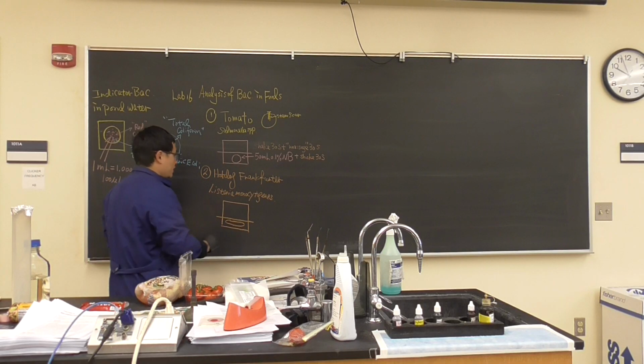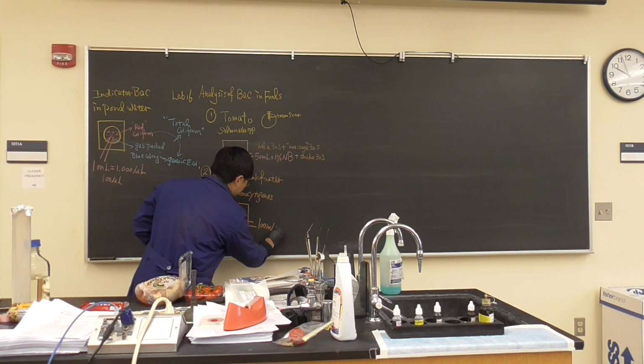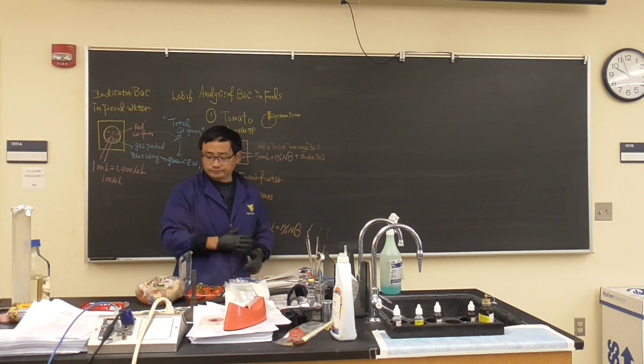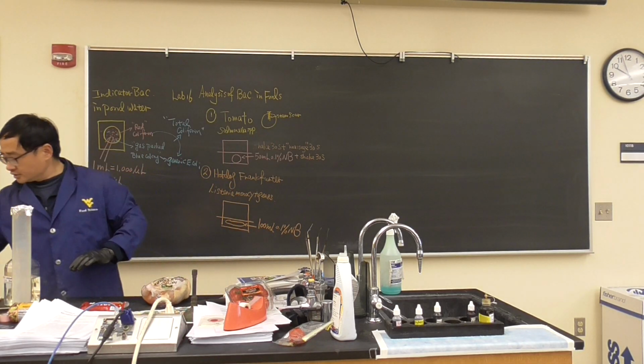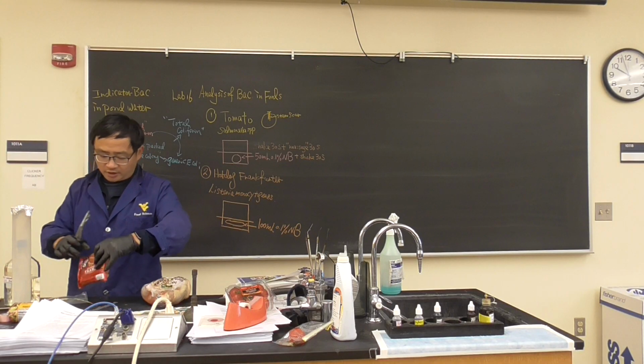And this time we add a little bit more. We add 100 ml of 0.1% nutrient broth. So how are we going to do it? The tomato is right here. We're going to get a hot dog. So we have another bag, the hot dog.